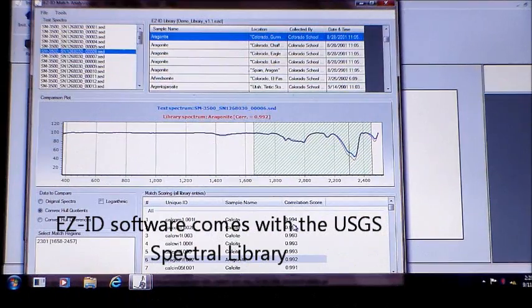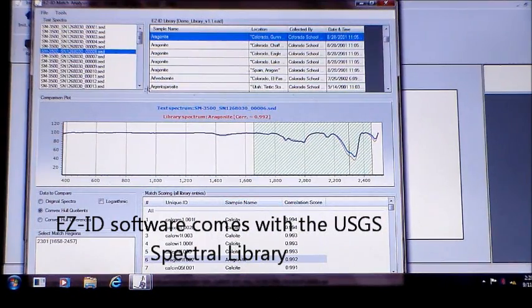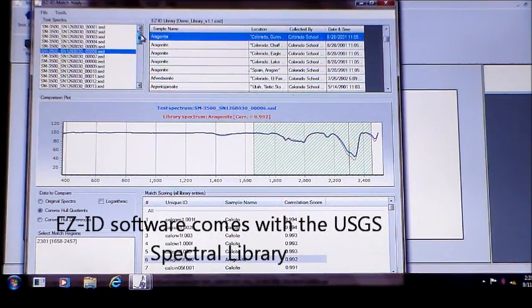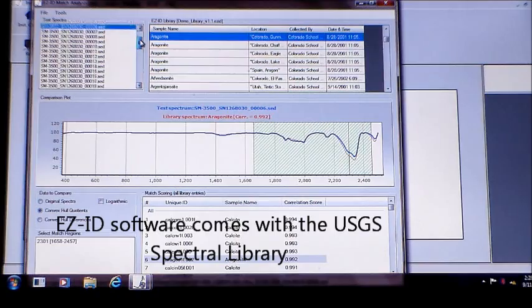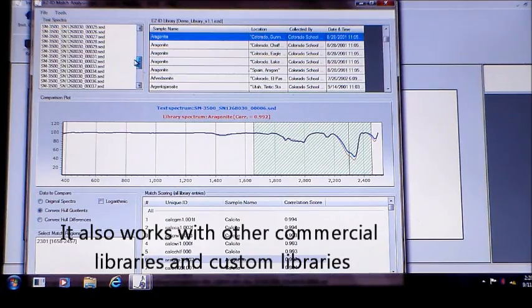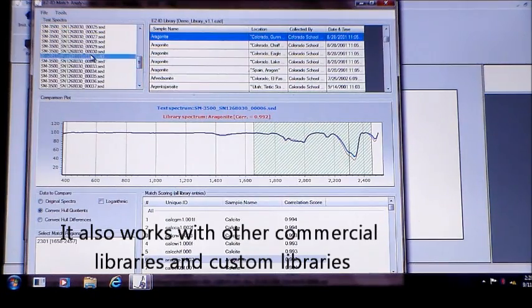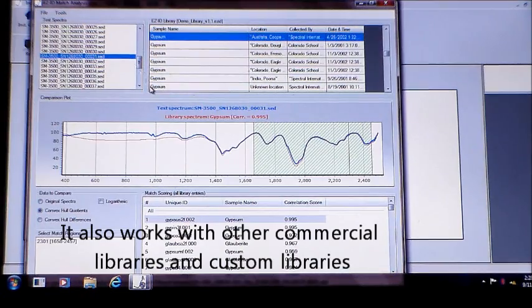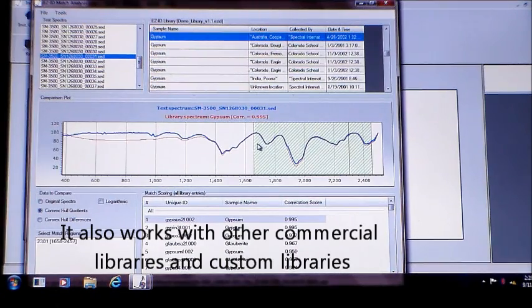EZID is shipped with the USGS mineral library. It also works with a wide range of commercial libraries. Or, you can build a custom library using our Custom Library Builder module.